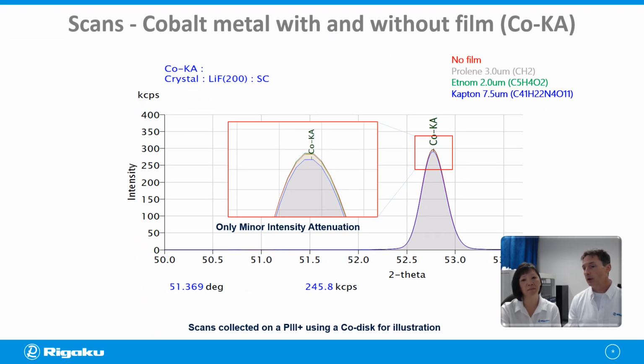Fortunately, for pharmaceuticals, you have very light matrices. So you get a lot of signal, you can get a good depth of analysis, and you can get good low detection limits for most of the metals.